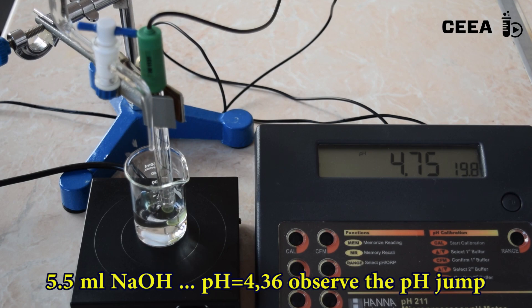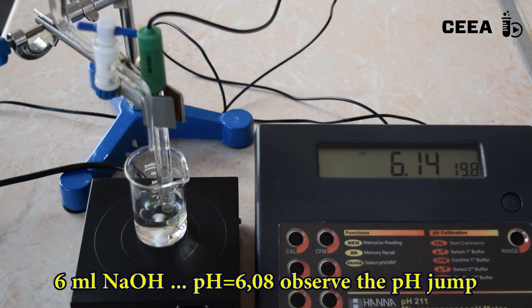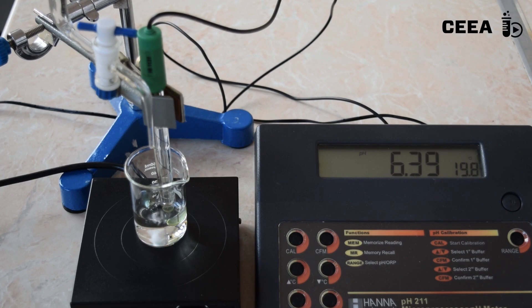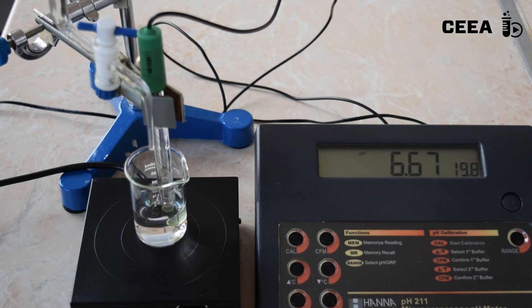At 5.5 ml of base added, observe a pH jump from 2.4 to over 6. This corresponds to the first ionization step of the phosphoric acid according to the shown reaction. Further addition of base will raise the pH slowly.